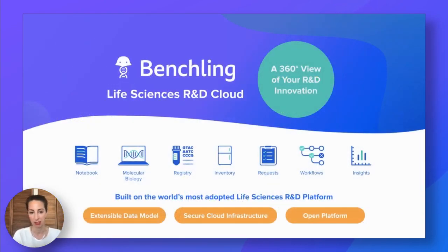Before diving into the capabilities for Benchling's solution in relation to RNA therapeutics specifically, I want to take a moment to introduce Benchling generally for those who are just hearing of our life sciences R&D cloud for the first time. Benchling was founded in 2012 by a team of scientists and engineers at MIT who were frustrated with the poor quality of software they had available to support their science. With over 300,000 users across the globe, Benchling is now a widely adopted cloud solution that gives users and management a 360-degree view of R&D innovation.